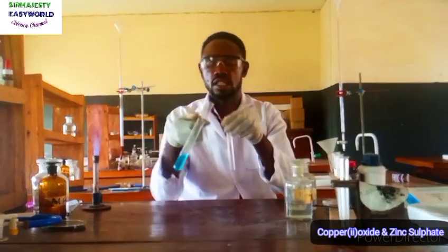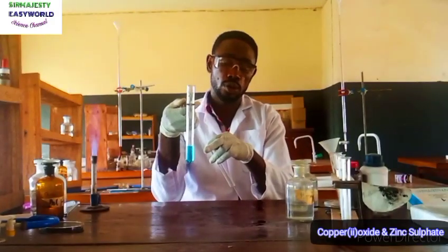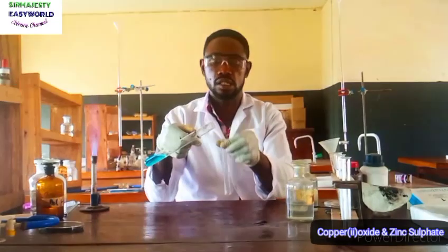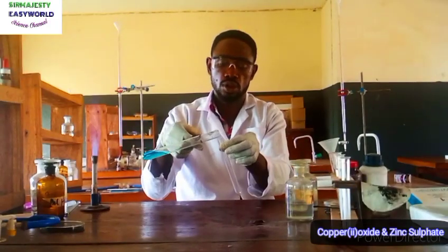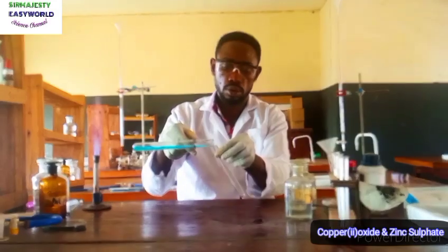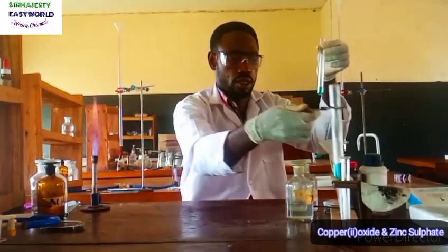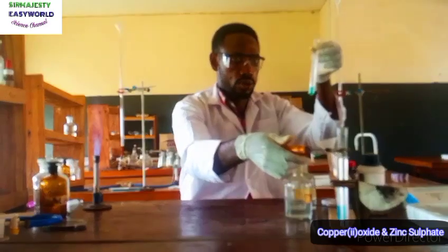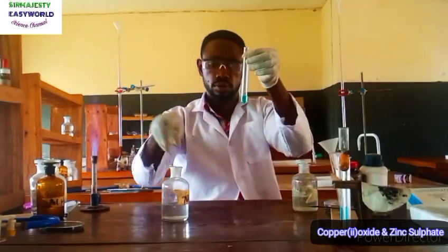There might be a chance that the ammonia will be used up by the acid, going first to neutralize the excess acid. So to get a more precise result, just collect a small sample over here and continue your experiment.